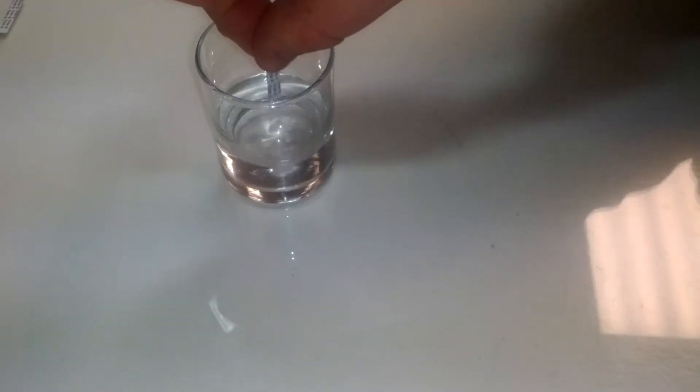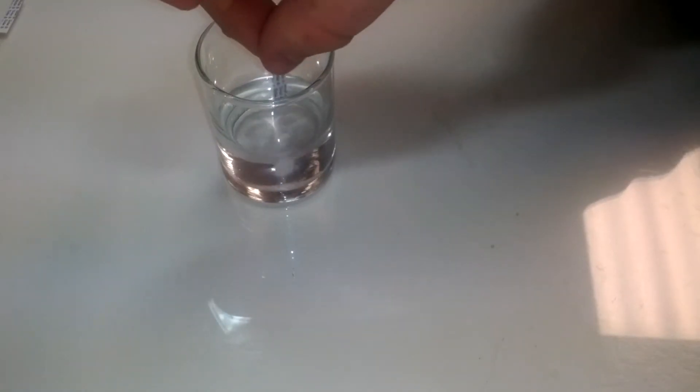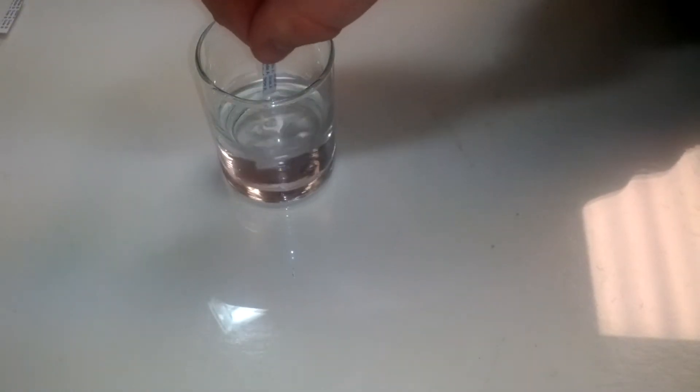Dip the detector in the liquid sample for 10 seconds, place it on a flat surface with side A facing up, and wait approximately 5 minutes.